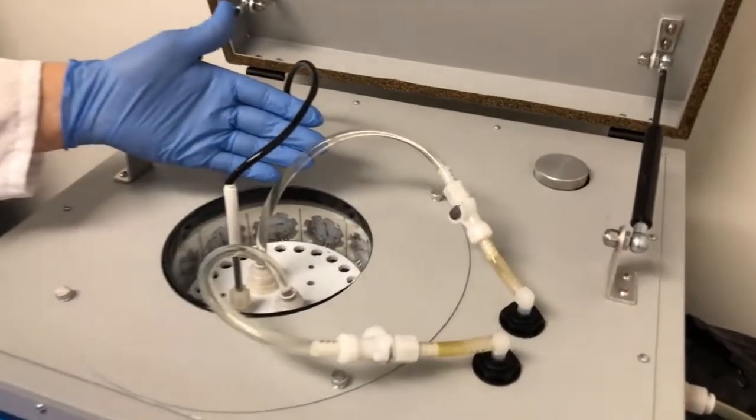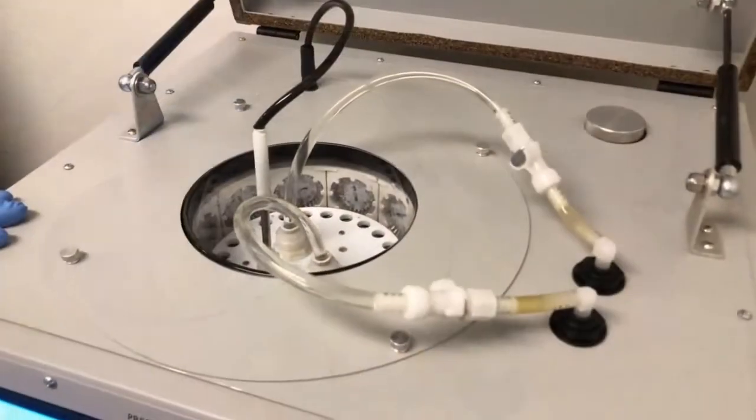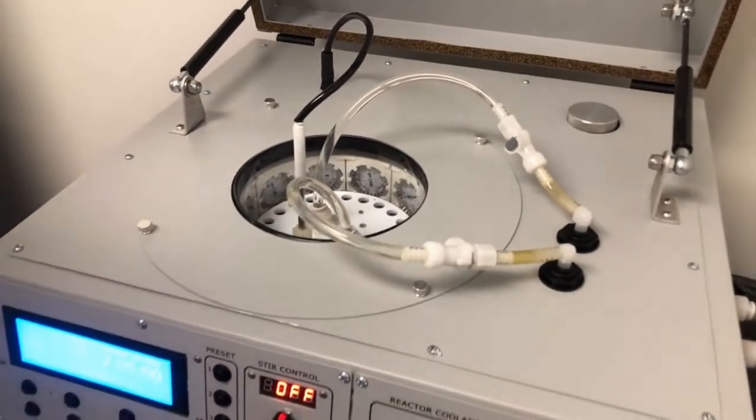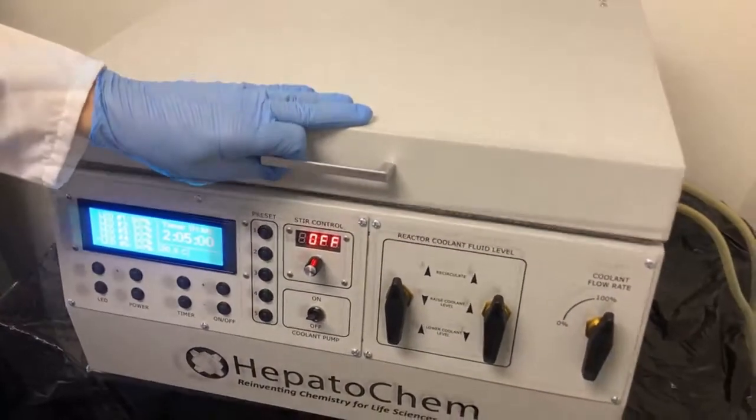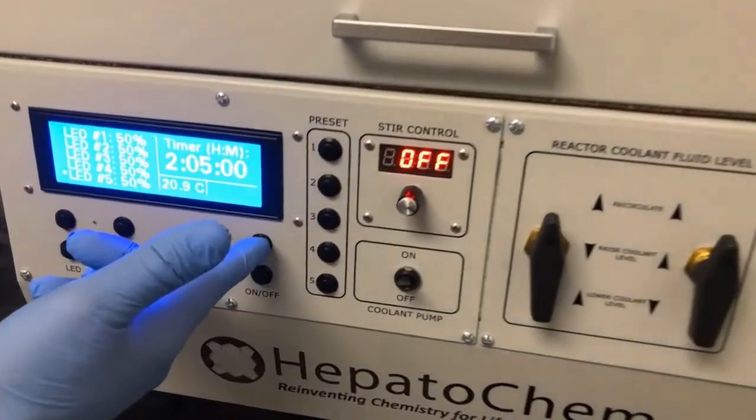As you turn on the pump, water will start to circulate. At this point, simply close the Lucent 360 and start the timer for the reaction. Then turn on the light modules and everything has started.